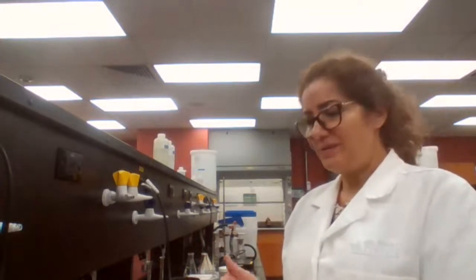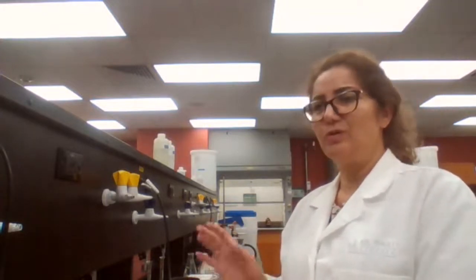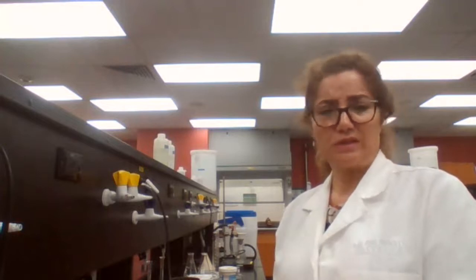Now, you do everything based on the procedure. You cool it down. You don't see crystals. What do you have to do in order to induce crystallization? What are the tricks that you could use in an organic lab to induce crystallization? This means that your sample has been heated, it's been cooled down to room temperature, you place it in ice, and you don't see any crystals forming.